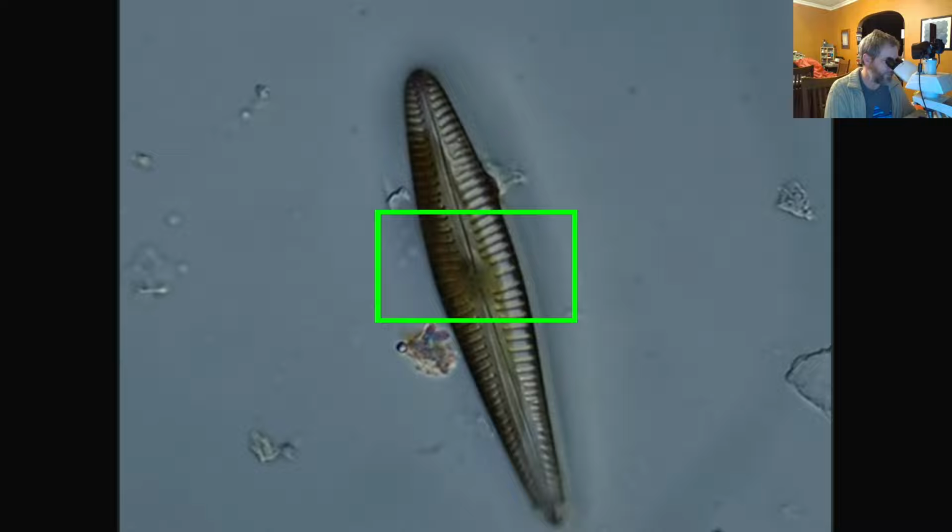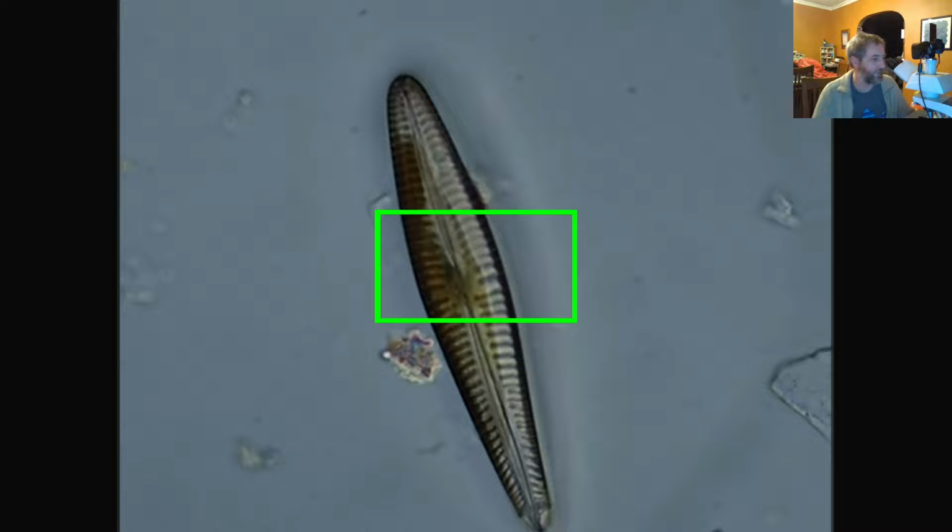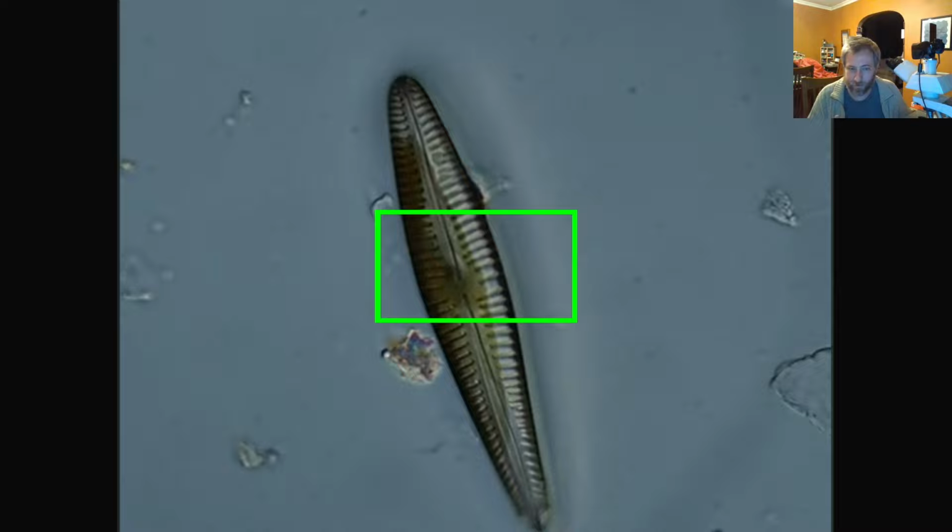That's not unusual for this group. But if we zoom into this middle area just one more time, see those two little dots right there? There's a raphe and a raphe coming from the other side, and there's like two little dots off on their own. That's pretty unusual. The other thing is it's enormous. This one's about 100 microns long, and most Gomphonema sort of max out before they get that big. So kind of cool.